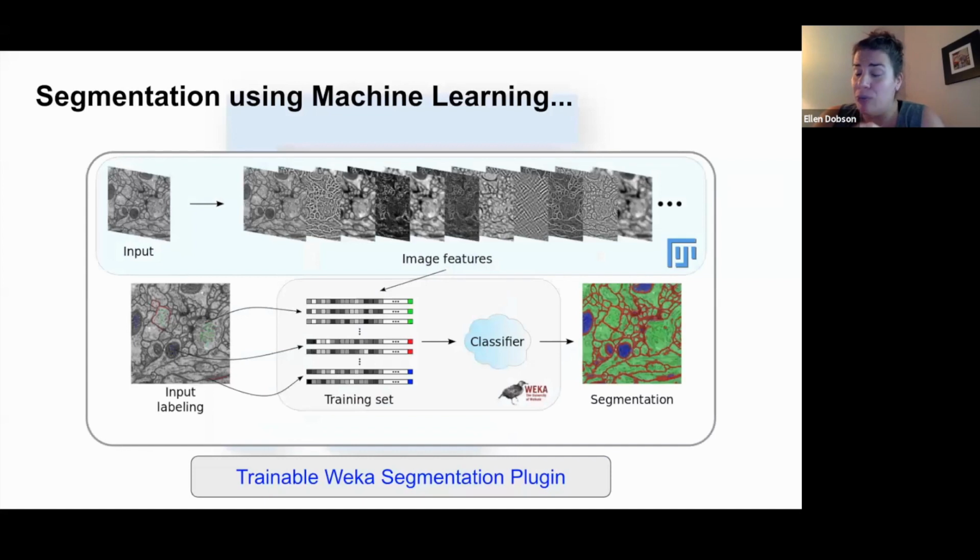This tool can really solve a ton of your segmentation cases. This plugin is called Trainable Weka Segmentation. It is fantastic. And the developer of this tool is absolutely amazing and also active on the forum. Basically, it's a plugin that you as a user can train, from your input, to perform the same task on unknown data later.